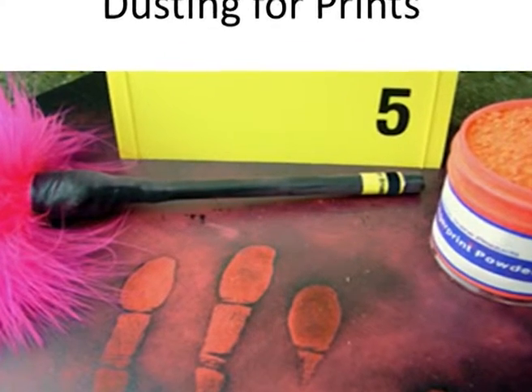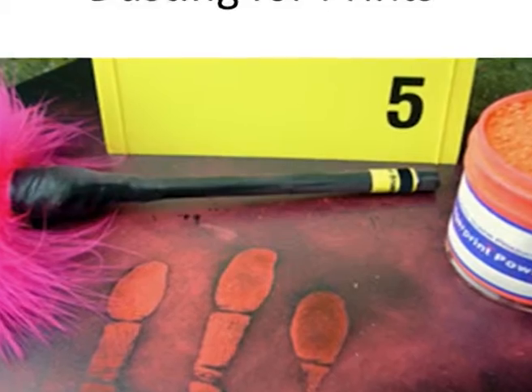Immediately before the fingerprints are to be developed, 20 ml of this solution is mixed with 80 ml of ethanol and 0.5 ml of 3% hydrogen peroxide. The test solution is applied to the article containing blood prints. On drying, the fingerprints are rendered visible.